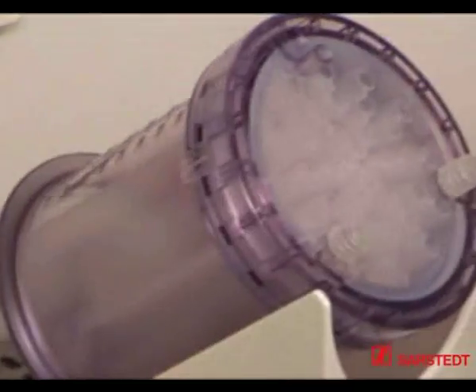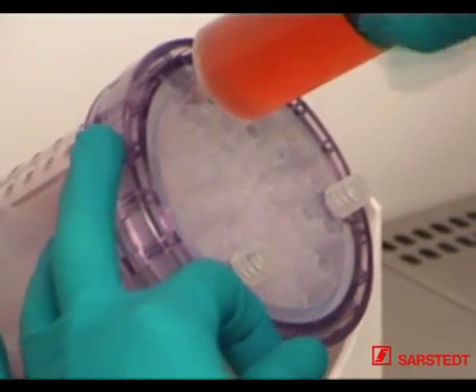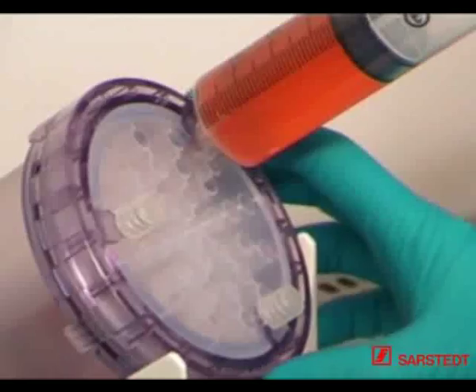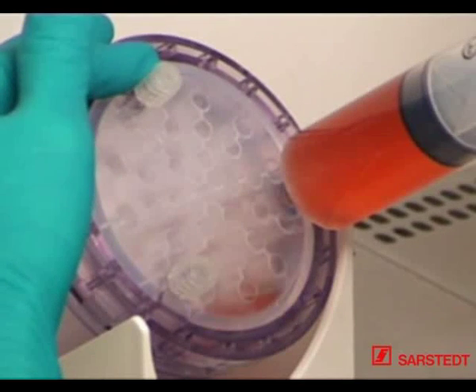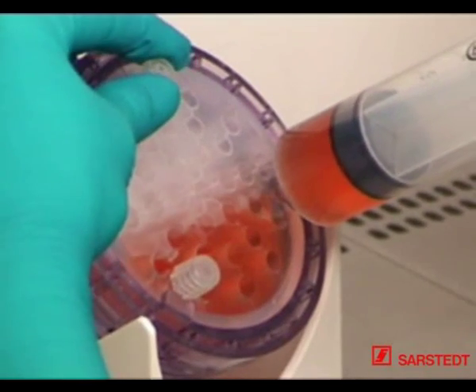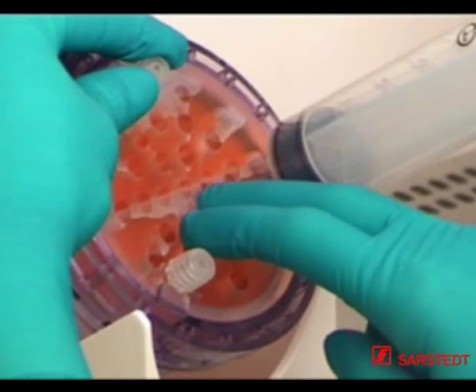Remove the screw cap and screw the syringe onto the LÖLOK connector. Rotate the bioreactor again until one of the remaining screw caps is located at the uppermost position. Loosen this screw cap to ensure adequate ventilation and pressure balance while the cell suspension is filled into the production module.